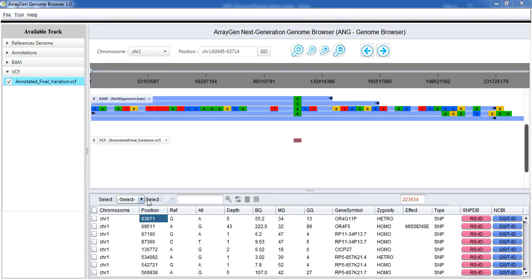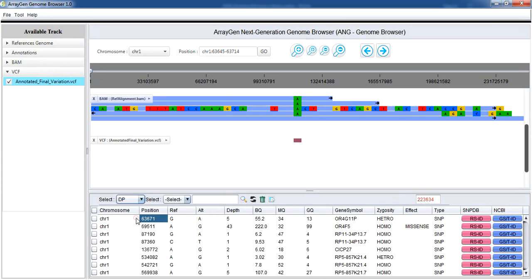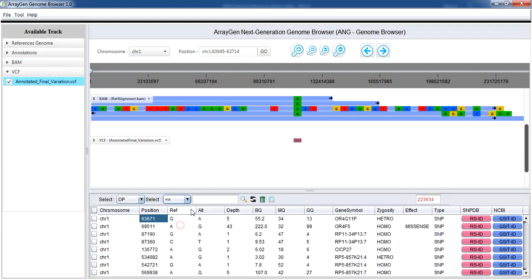The variation data can be filtered and viewed using this search content icon. For example, select depth as less than equals 4 and export as .txt file.